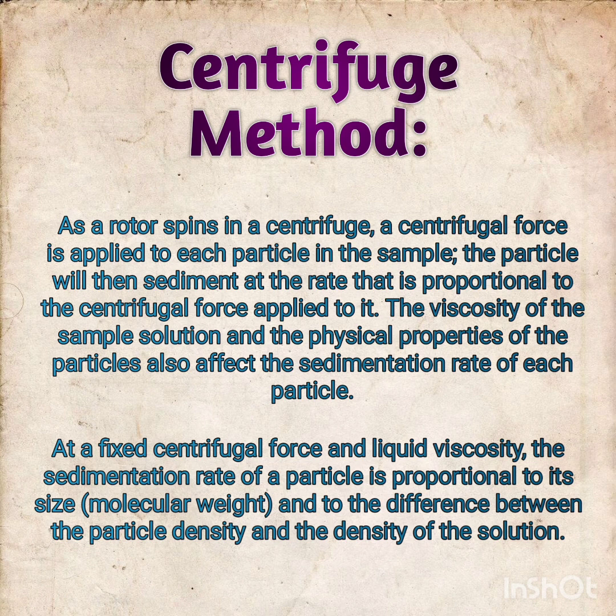At a fixed centrifugal force and liquid viscosity, the sedimentation rate of a particle is proportional to its size and the difference between the particle's density and the density of the solution. These are all the factors which have an influence on centrifugation, as we had already studied in the previous slide.